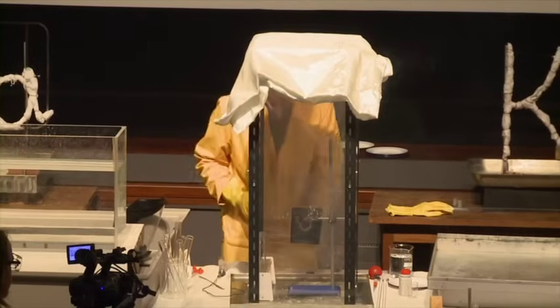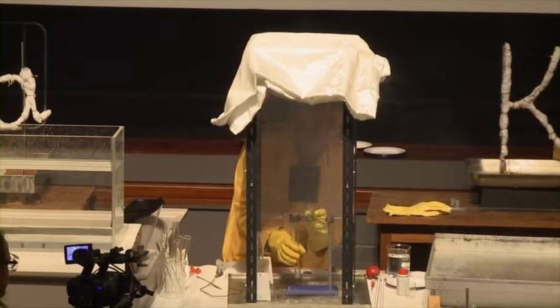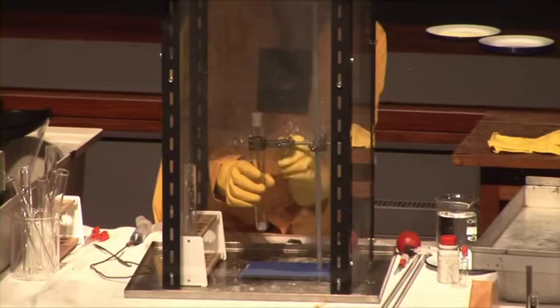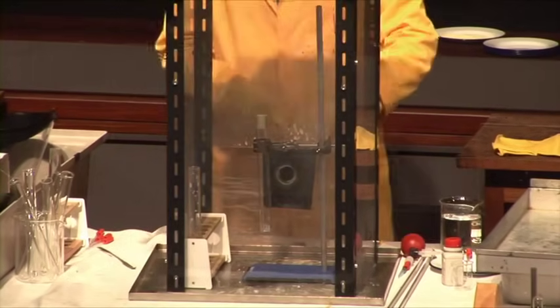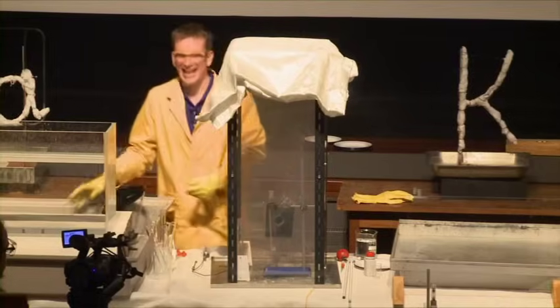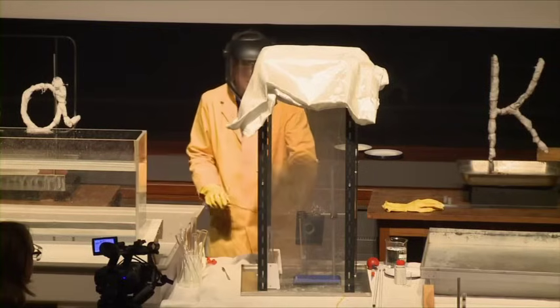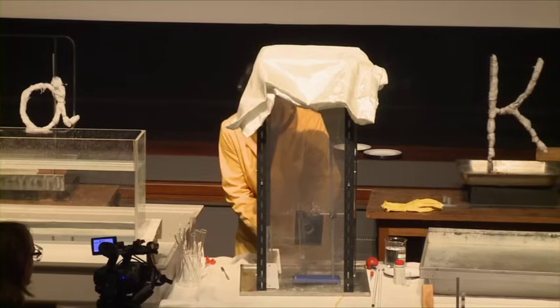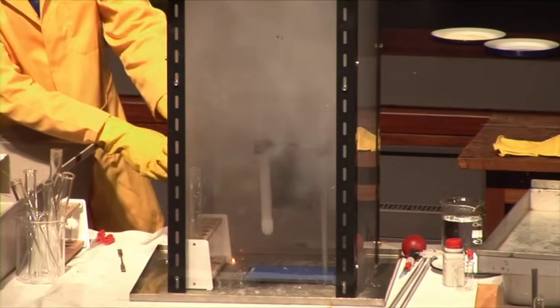Potassium. Again, the same quantity, the same number of atoms. We're trying to keep everything as controlled as possible. The same quantity of water. Just as an added safety precaution, I think I'll put this on. So potassium now — and water. Getting more vigorous.